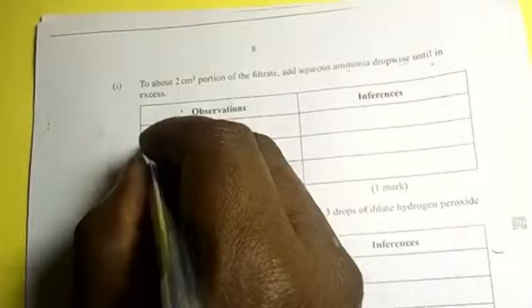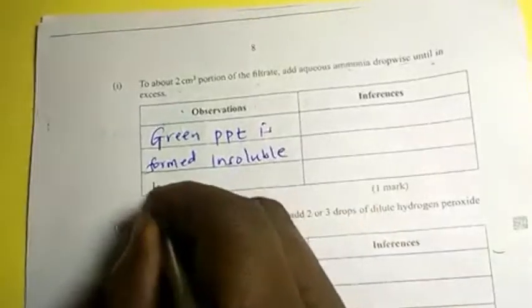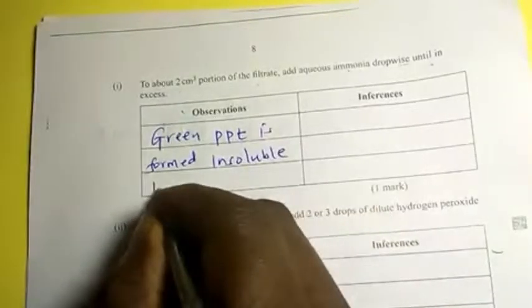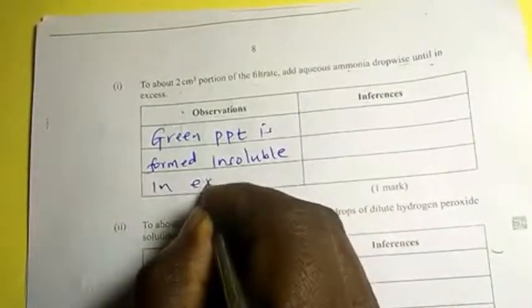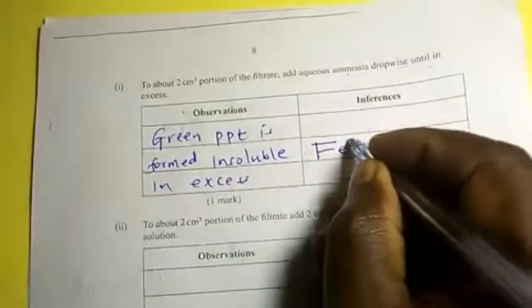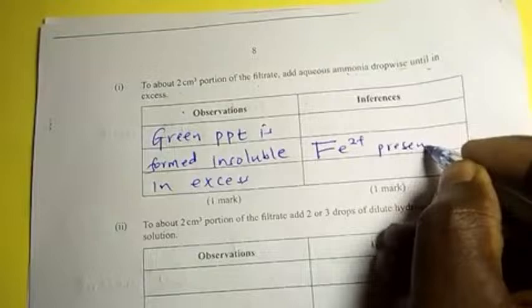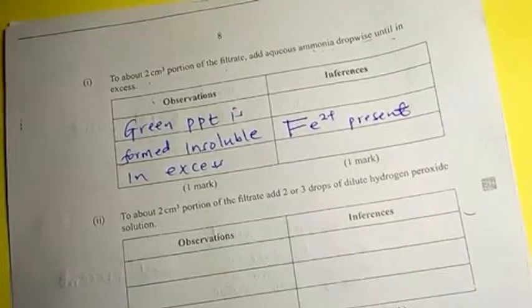Then a green precipitate is formed, which is insoluble in excess. That one is iron 2 present. Iron 2 is present.